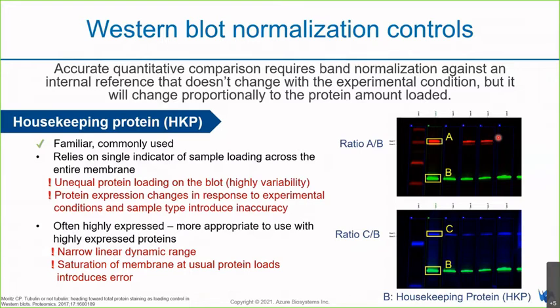Firstly, you might have been using an incompatible lysis buffer, so your protein concentration determination has error. Second, you might have inconsistent protein loading into each lane due to bubbles in the pipette tips. This most likely results from human pipetting error.